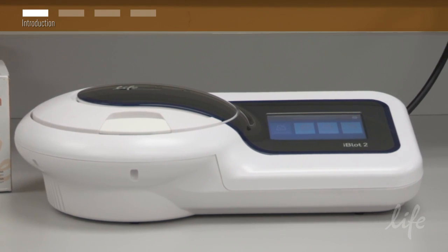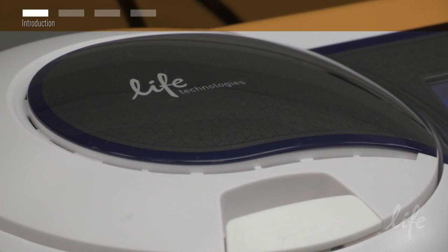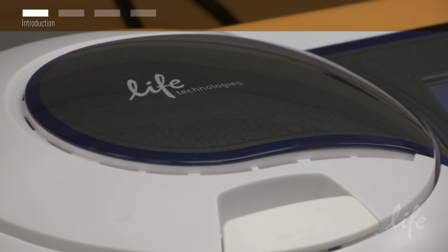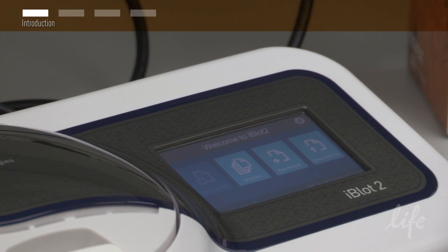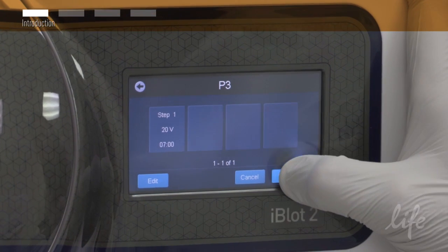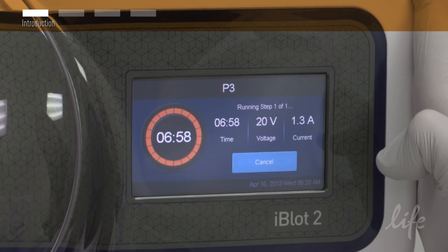The iBlot2 dry blotting system, based upon the original fast transfer system, efficiently and reliably transfers proteins from polyacrylamide gels for Western blot analysis in seven minutes or less without the need for buffers.